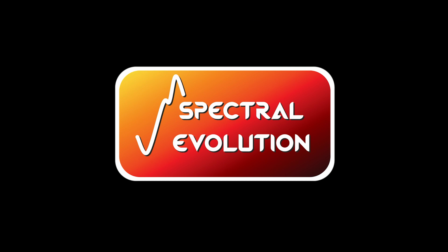One question that just came in is, is it possible to calculate the percentage of water content of a leaf from the spectrum? So yes, it is. Spectral data will give you a qualitative approach to analysis. What you get from your spectrometer is the spectral curve, which will show you the location of the absorption feature.